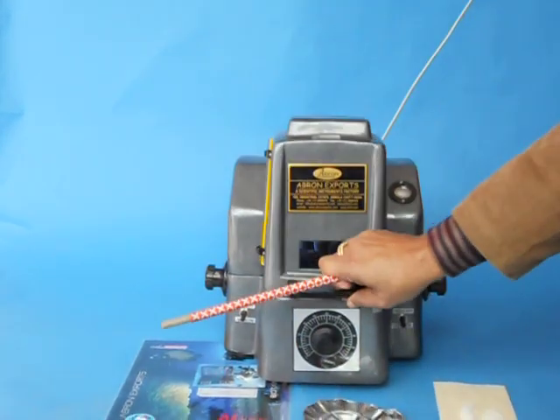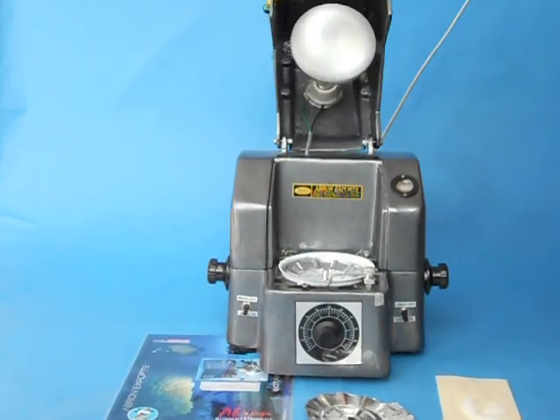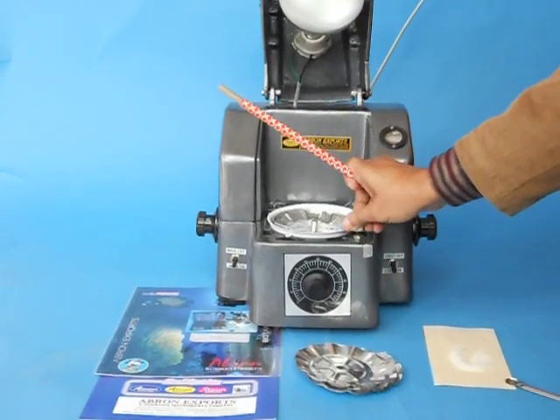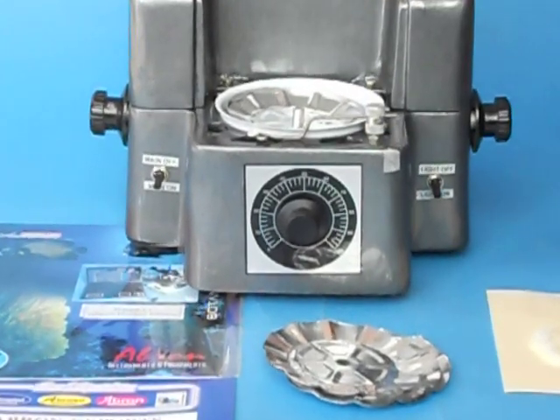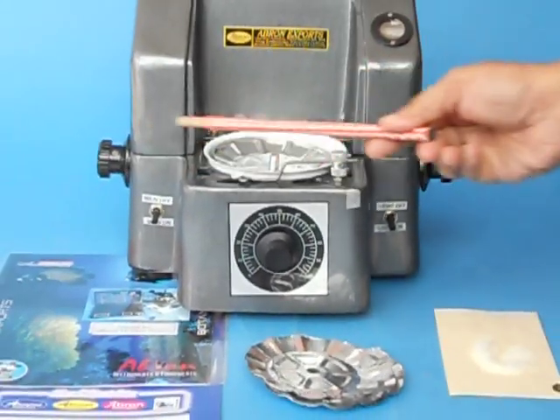To start with, you just remove this lock, keep it on the side, and adjust the 0% with both these scales.